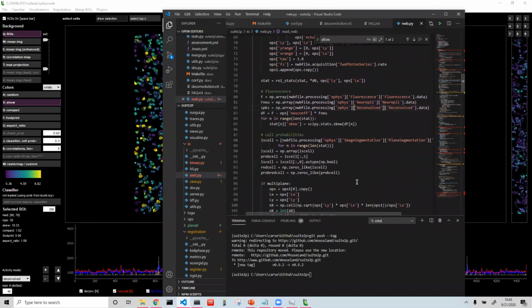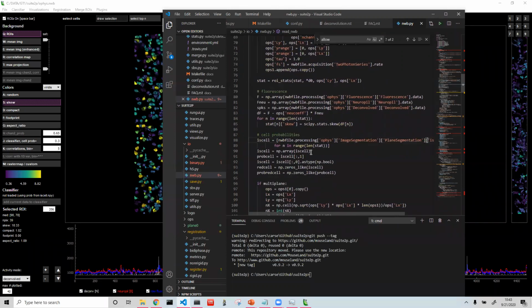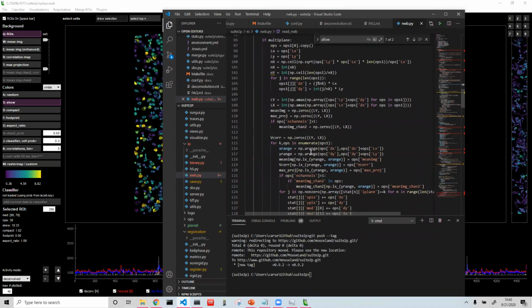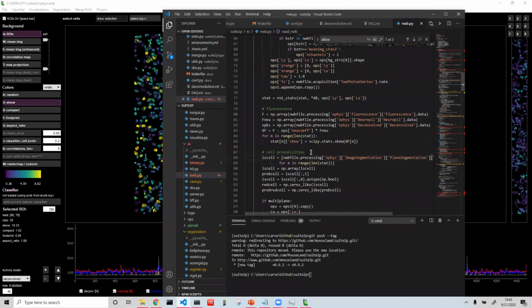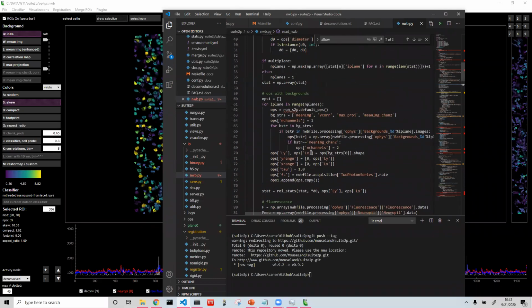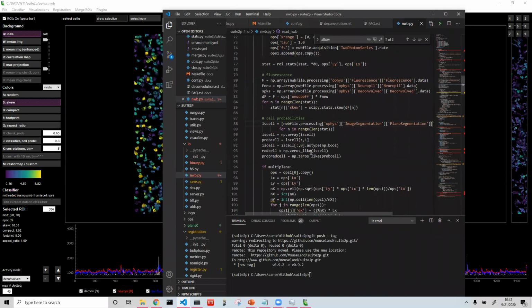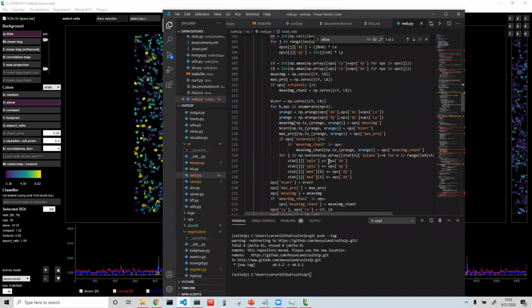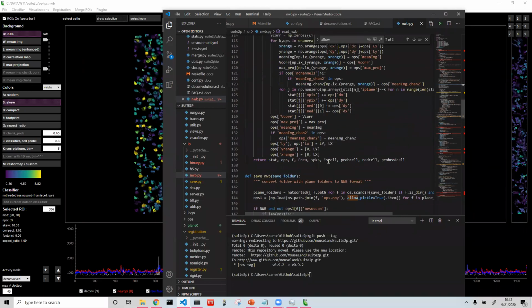Yeah, I also made this one too. This is iscell. So that's this classifier field. I think, yeah, right now it requires the iscell field as well. And in the future, I could make it so that you don't need to have the iscell, so that if I load it from another algorithm, it could just assume everything is a cell. Yeah, because I'm guessing most people don't have that iscell field. I'm glad you think it's a useful field.